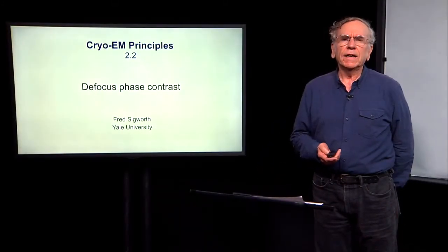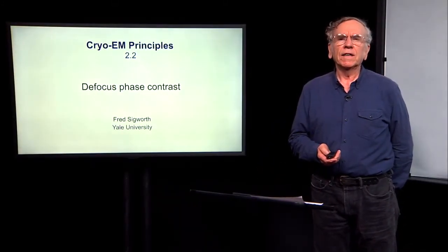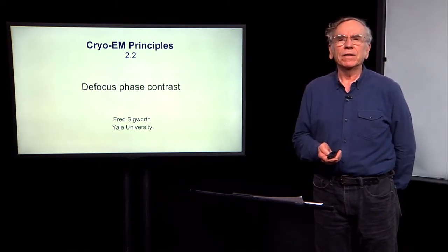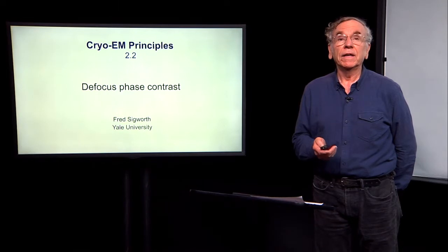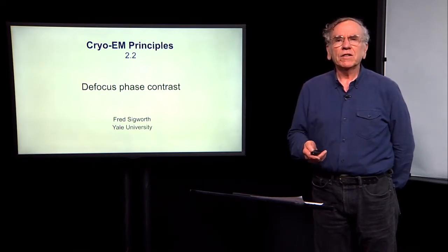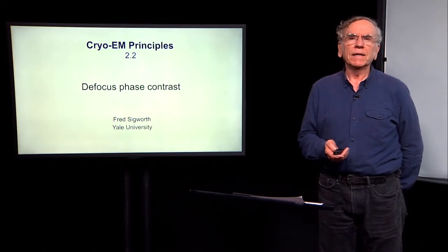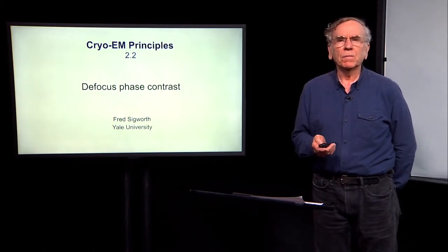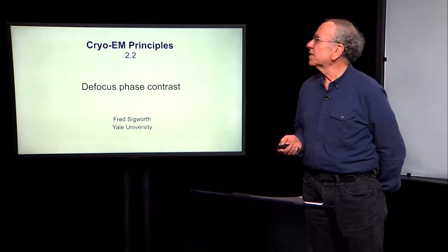So time before last, we talked about, I think, a technical scandal: that people obtain their CryoEM images by throwing the electron microscope out of focus. There are actually better solutions coming, a device called the phase plate, which we'll talk about later. But today, I want to talk about defocus phase contrast.